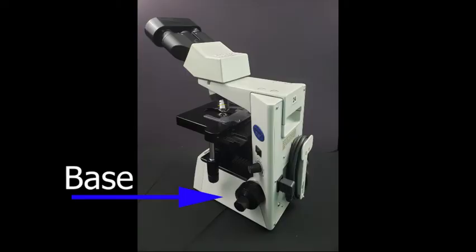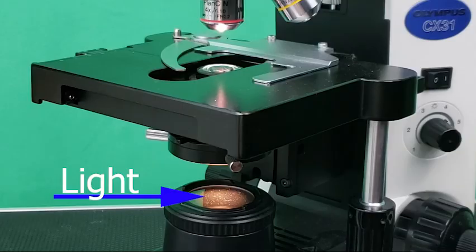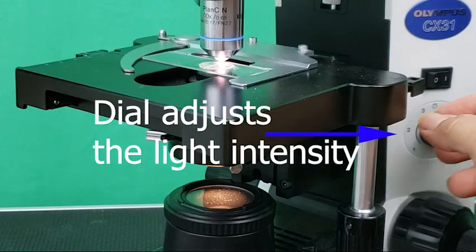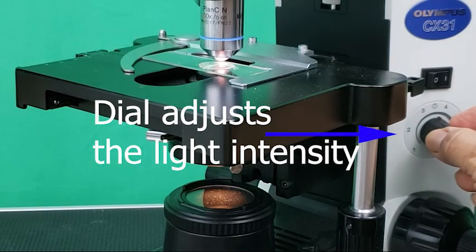Base: The bottom support of the microscope. The base includes the following: light and power switch. A light is a source within the base that illuminates the specimen. Light comes from below and passes through the slide. It could be electric or it could be reflected in older microscopes. Power switch: A switch either at the side or the front of the base turns the light on and off. A dial adjusts the light intensity.